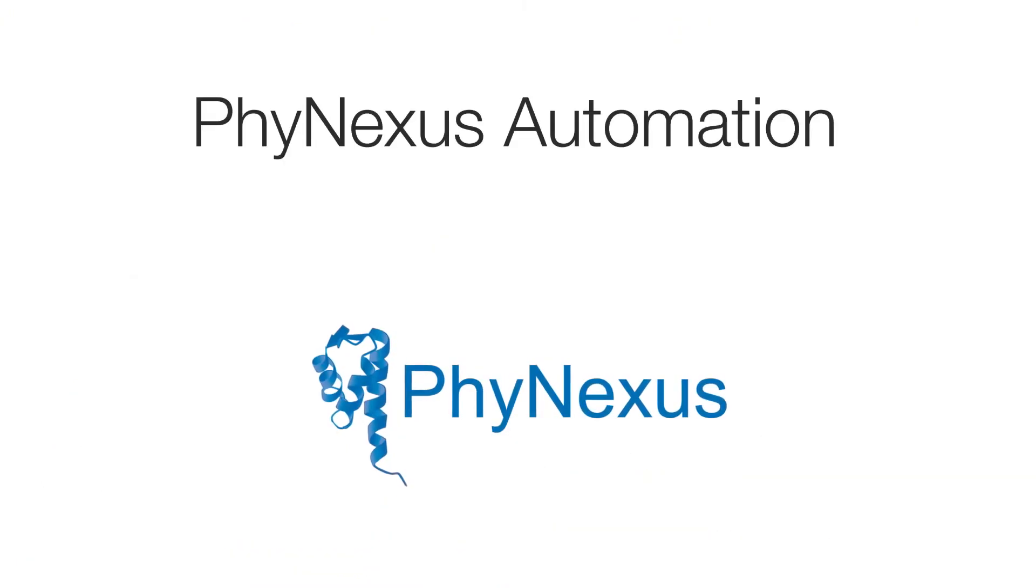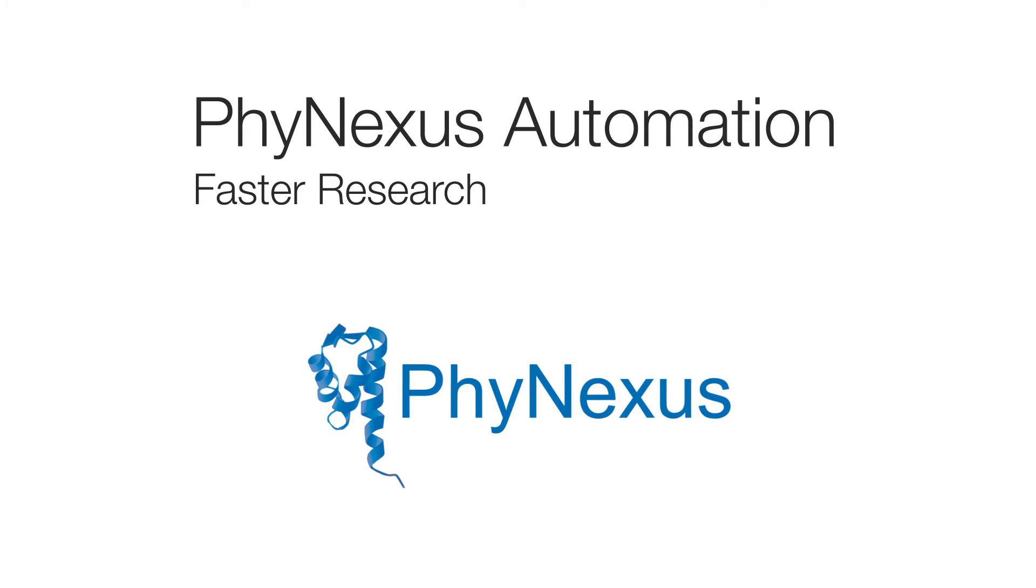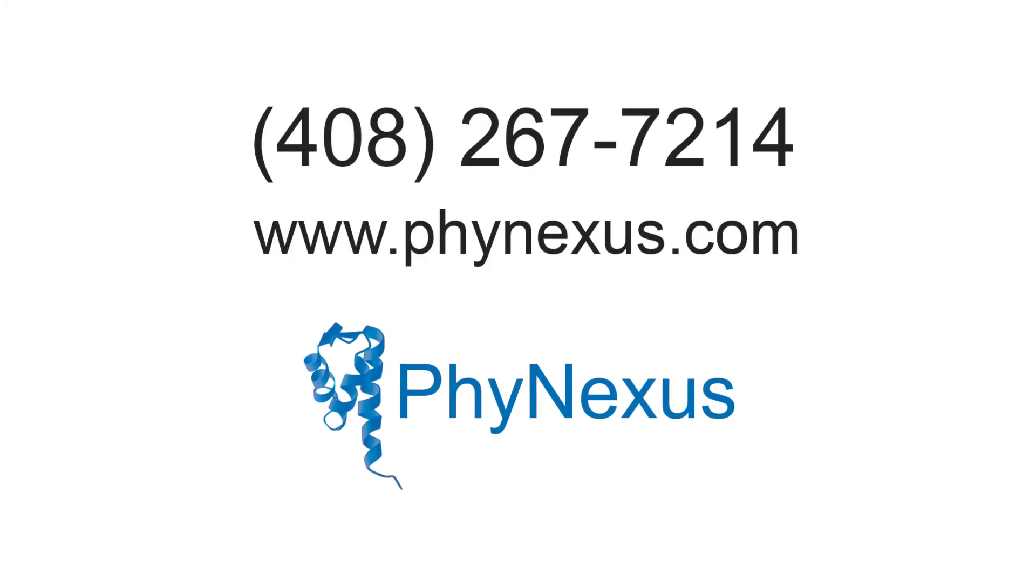Phynexus Automation. For faster research. For better research. Contact your Phynexus representative today.